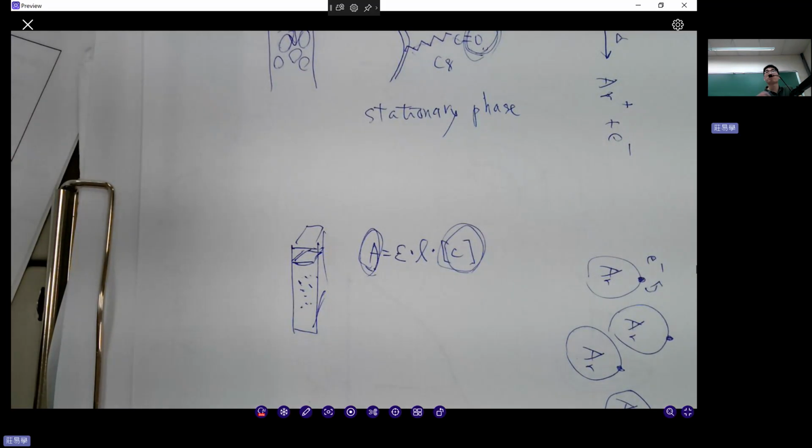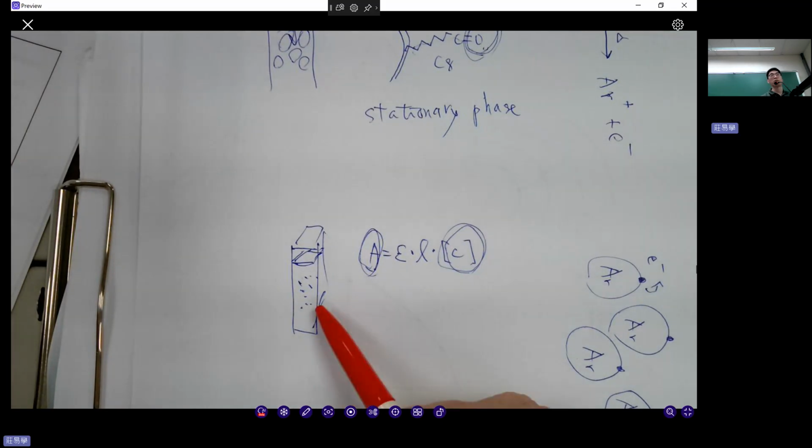However, environmental samples usually contain more than one compound, right? They contain a whole lot of junk apart from your target analytes. So we have compounds A, B, C, D, E, all the way to compound Z. So many different compounds in a mixture, and you don't exactly know what's inside.